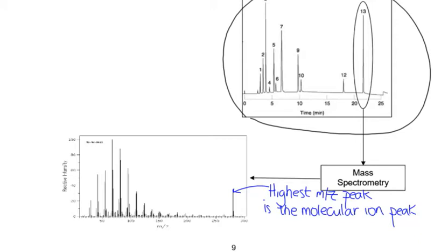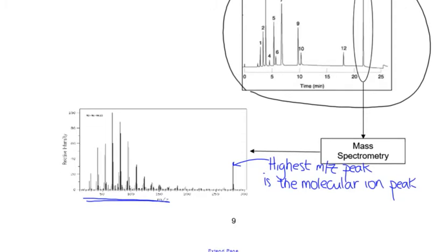How could you tell from this spectrum which type of ionisation has been used? This spectrum has lots and lots of additional peaks, fragment ions. If you've got lots of fragment ions, you must have used electron impact, because remember that electrospray doesn't produce fragments. So the molecular ion peak is just going to give us the Mr, because the value for that on the bottom scale here is the Mr. There is a small peak just to the side. Remember that the small peak just after is the isotopic peak due to carbon-13 and hydrogen-2. So just remember that that happens too.